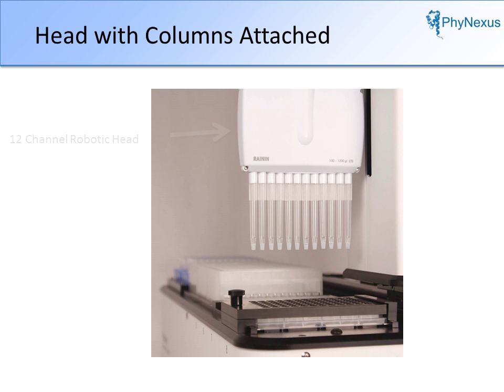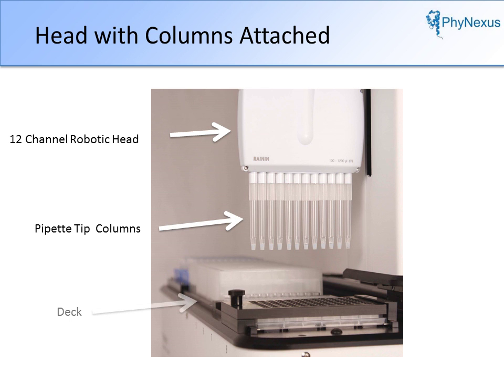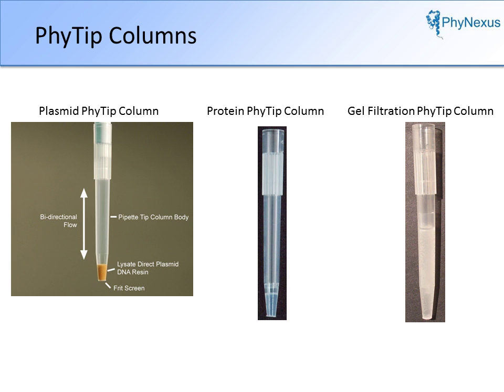The instrument is based on a 12-channel head, to which pipette tip columns are attached. 96 samples are processed 12 at a time, moving across 8 rows on a plate. Shown here are 3 types of columns that may be operated on the instrument.